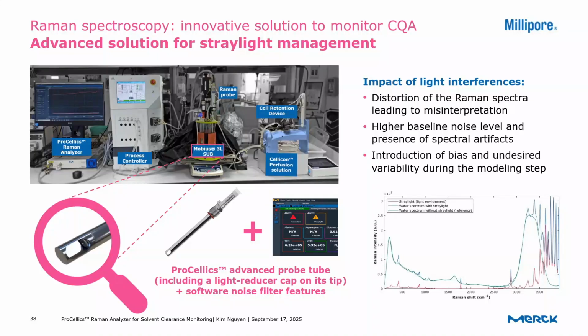These can overlap with specific Raman wavelengths that you need to use for process insight, either masking that information or resulting in inaccurate model building or inaccurate conversion by the model into quantitative or qualitative data for understanding and decision making and potential automation.